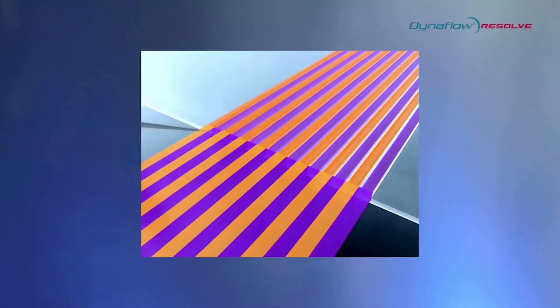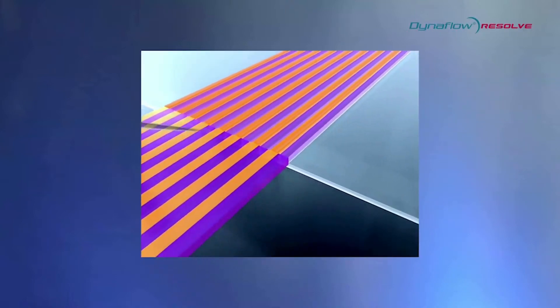Cells are added to the chip and a cell is patched and lifted from the bottom of the recording chamber. The Dynaflow software will place the chip in front of the cell and move the chip in front of the patched cell.